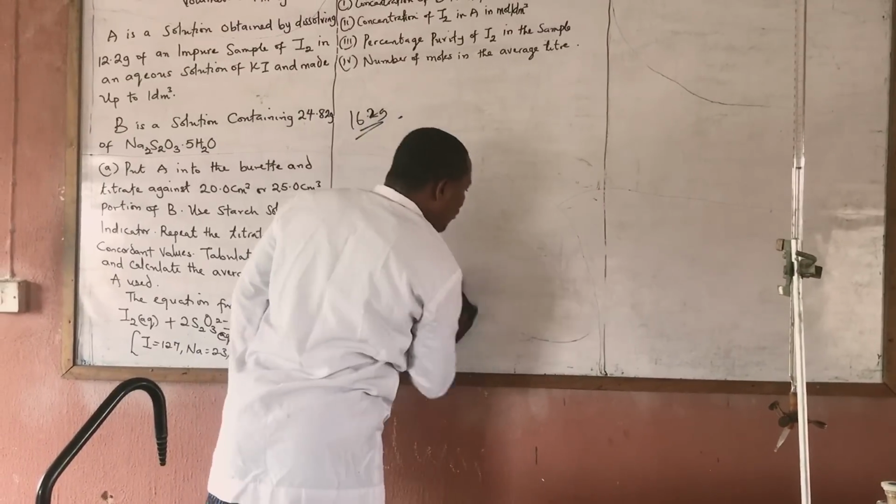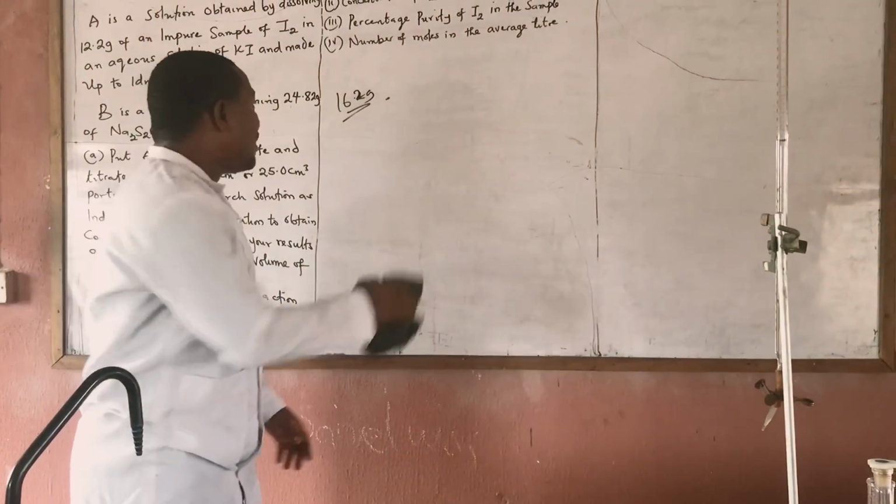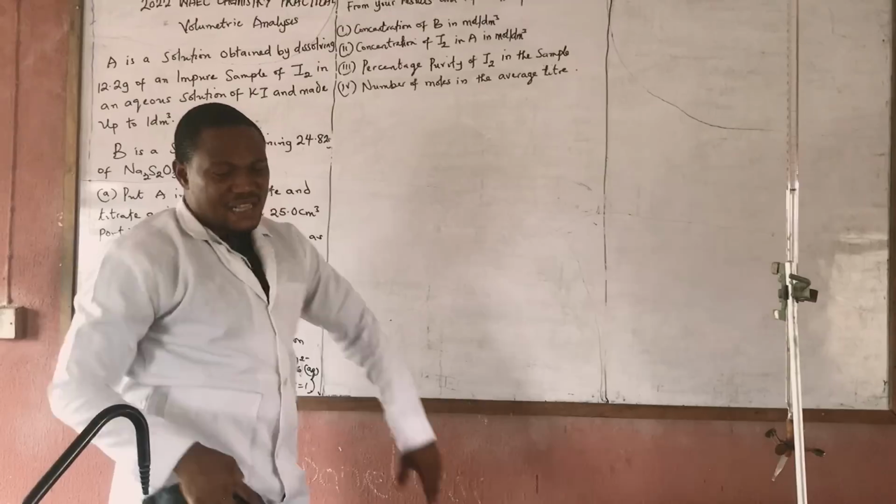So very quickly, I'll go to the titration now. We don't need to get ourselves worried.